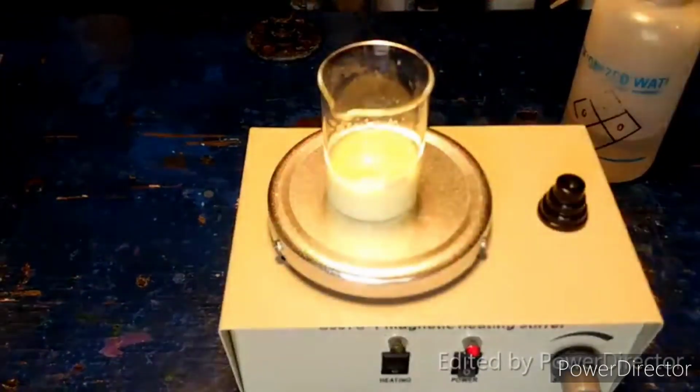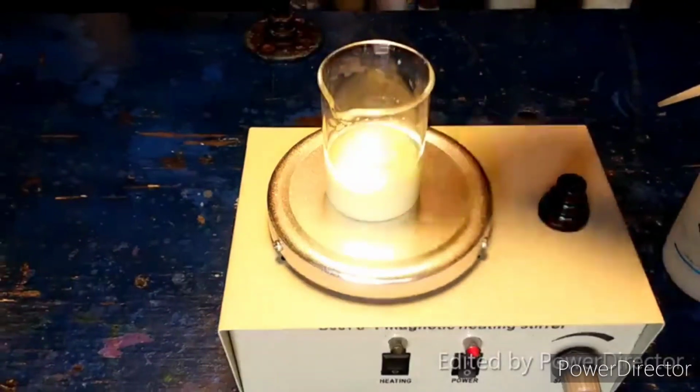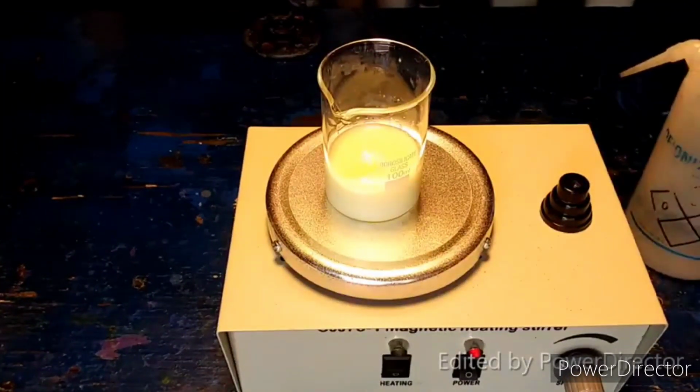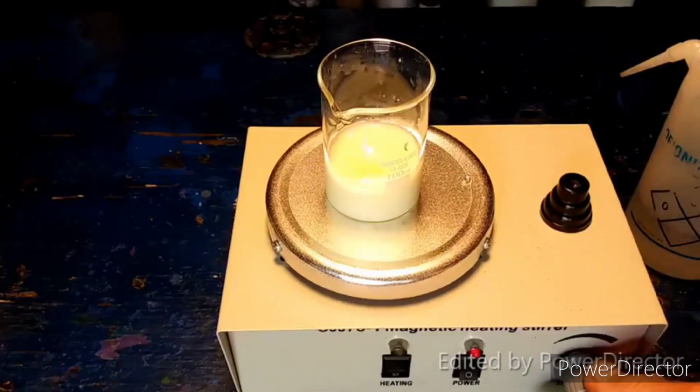Okay. And that precipitates out the sulfate as barium sulfate, leaving us with uranyl chloride in solution. There we go. Let that stir up real well.